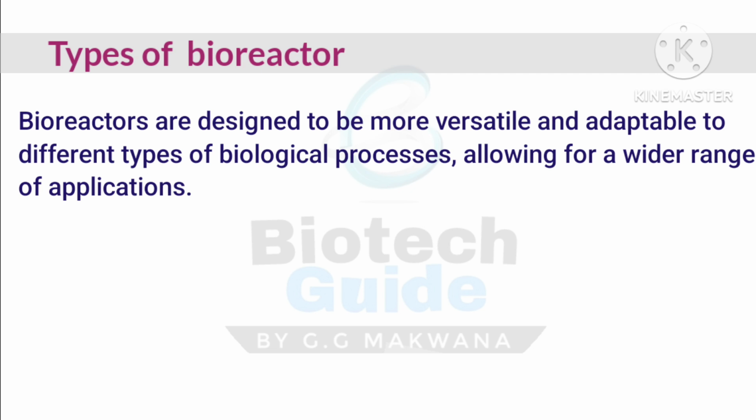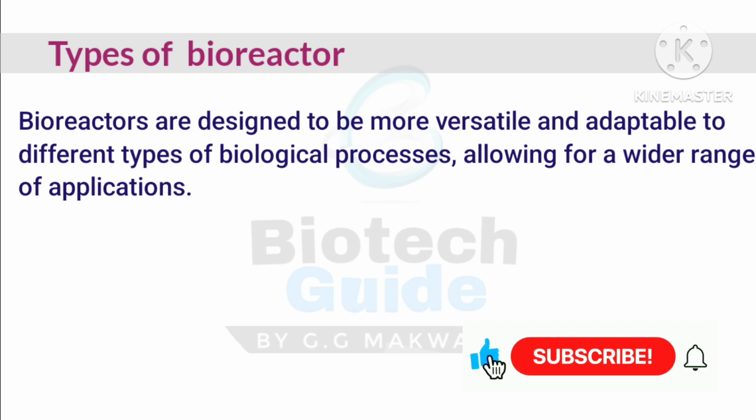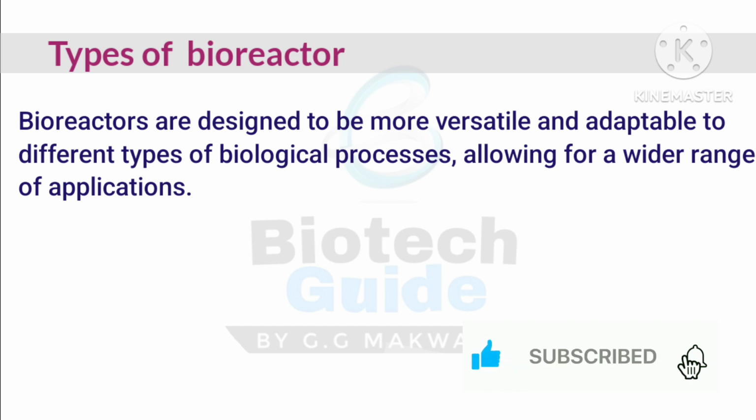But in the case of any fermentation process, a normal fermenter has mixing components like an impeller for agitation, a sparger for aeration, the various controlling probes, and the inlet and outlet units. Those are all important controlling units or devices required for any kind of fermentation process. But in the case of any kind of bioprocess, mainly a specific design or a versatile adaptable bioreactor is required.